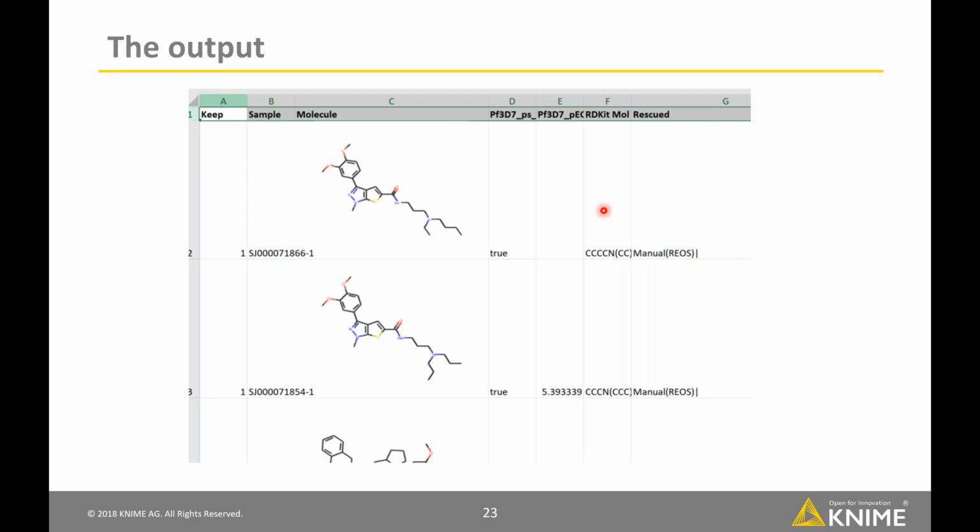Great. We've got another question here from Mark Gardner. It says, "Hi Greg, nice workflow. How often did you find 4 reasonable analogues to pick for each hit/centroid?"